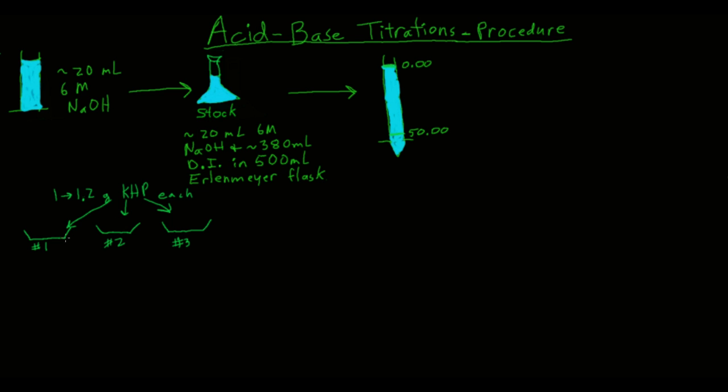Get three weigh boats and label them number one, two, and three. Put weigh boat number one on the balance, tare it, and add somewhere between 1 and 1.2 grams of KHP — potassium hydrogen phthalate. Record that mass in your data table to three decimal places. Do the same for weigh boats number two and three.